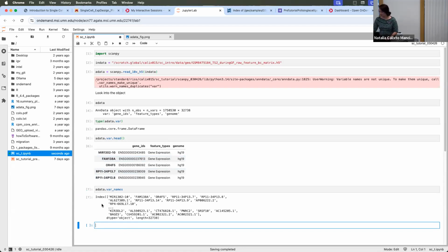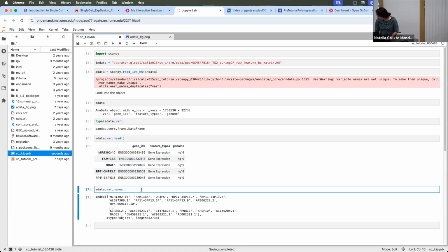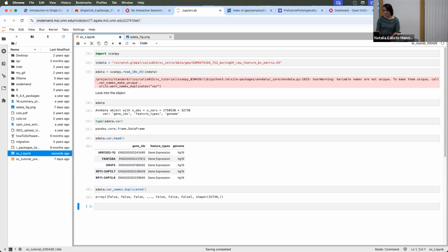And okay, so let's say, how many are duplicated? Okay, let's count. How many are true? Okay, so count them. We have 95 duplicated names.